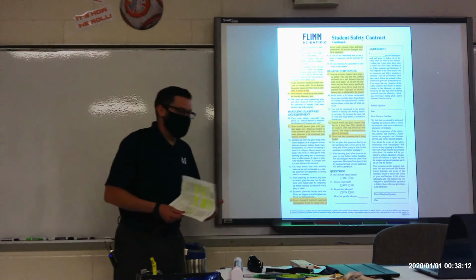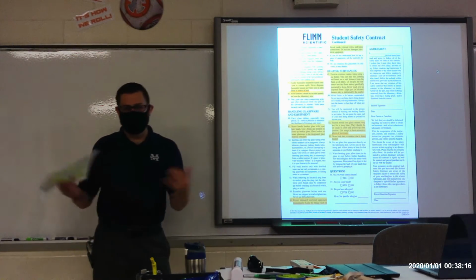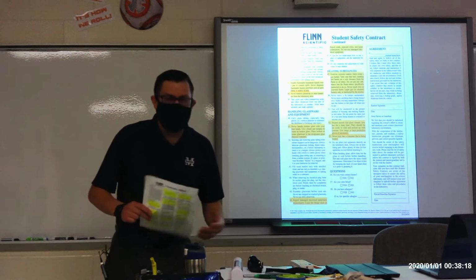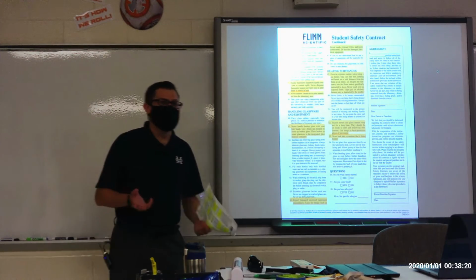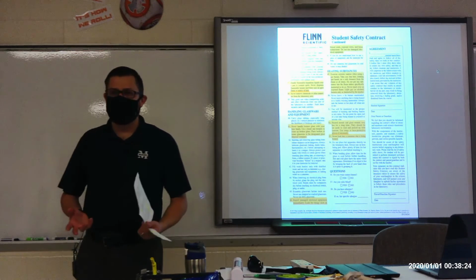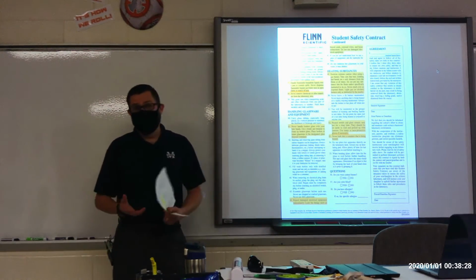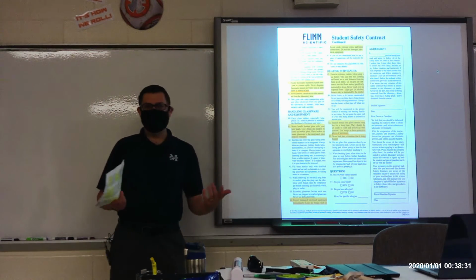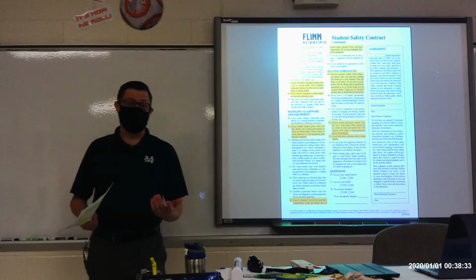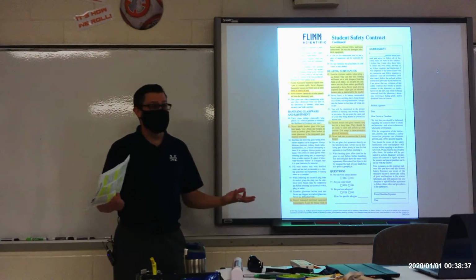And something else is a lot of people have boiled water before because they've made spaghetti or whatever. Steam can burn you just as easily as boiling water. So if there's steam coming out of something, you don't want to be sticking your face in it, because that could scald you. Again, this is common sense stuff that I would assume you already know, but I'm always surprised how many students act like they've never been in a kitchen before.